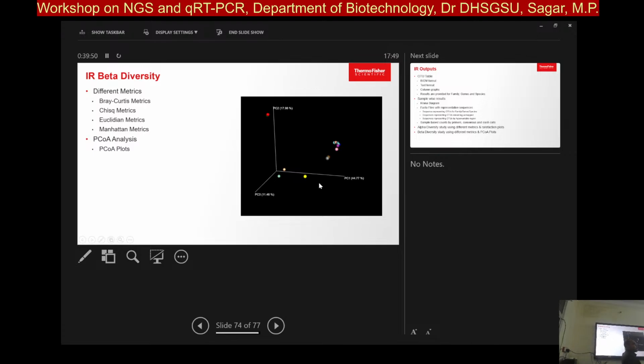So principal coordinate plots. ये association इसलिए करते हैं कि कैसे species या genus के basis पे वो samples are having correlation. Okay. So जैसे samples, ये वाले samples, ये वाले they come very close to each other. But these samples are more eliminated, or I'll say very far away from them. सो इनके अगर metadata means उसके related जब features study करते हो ना, वो features बताते हैं कि वो कैसे अलग है.